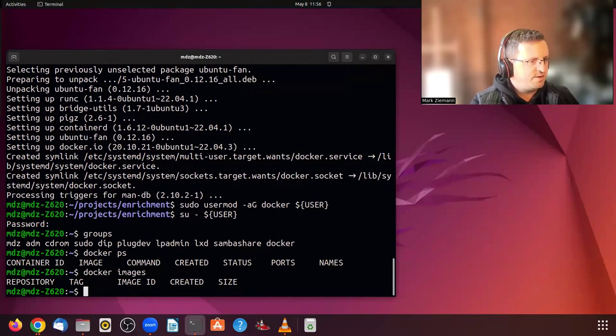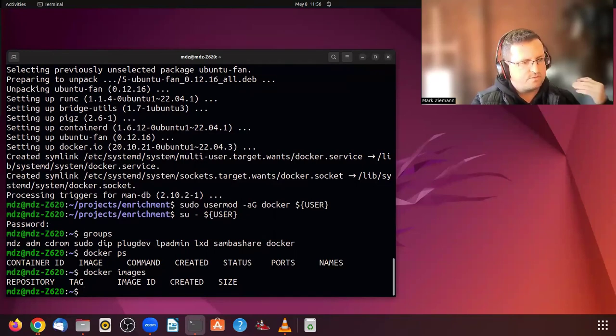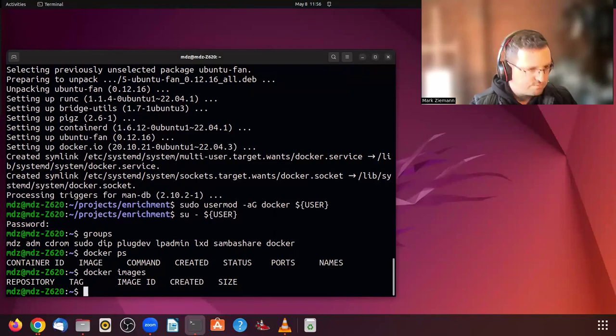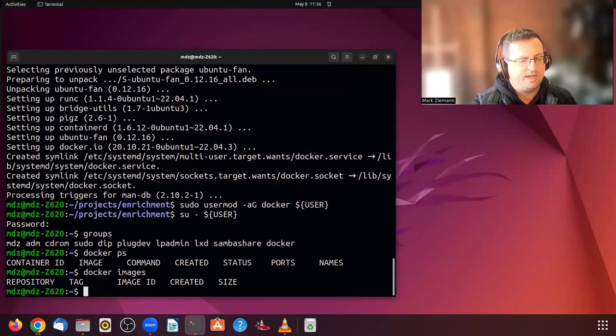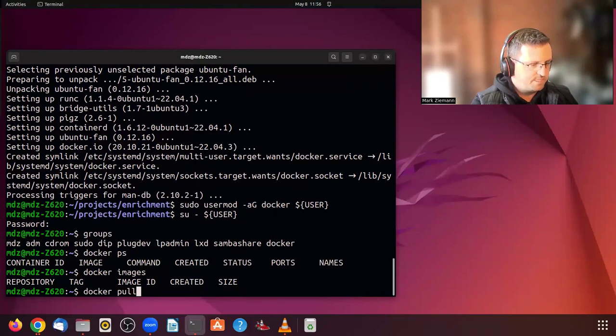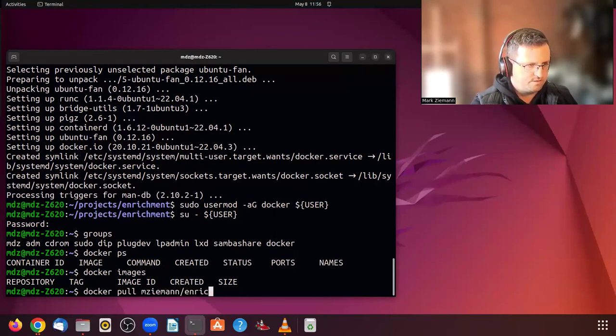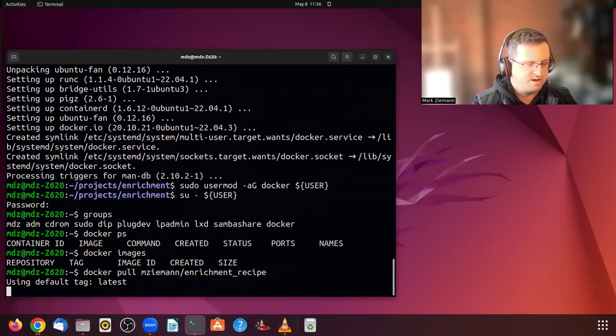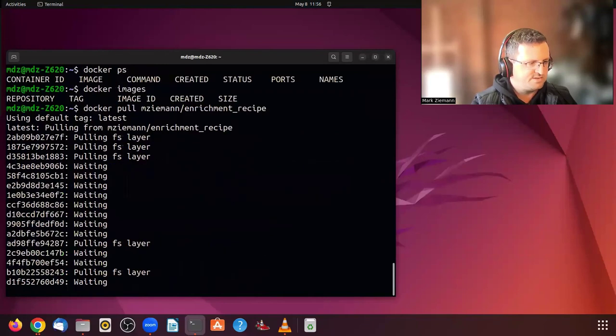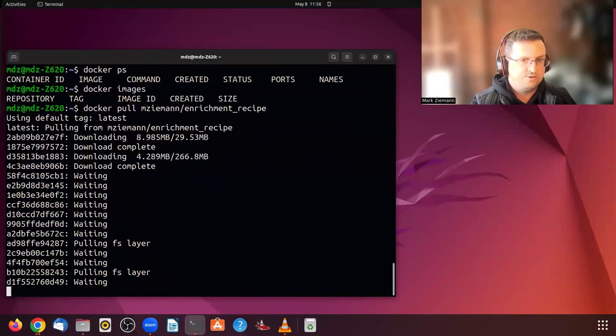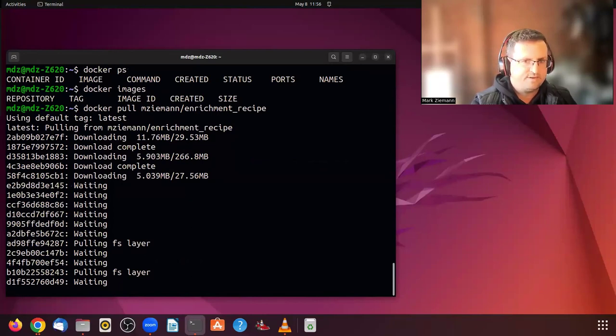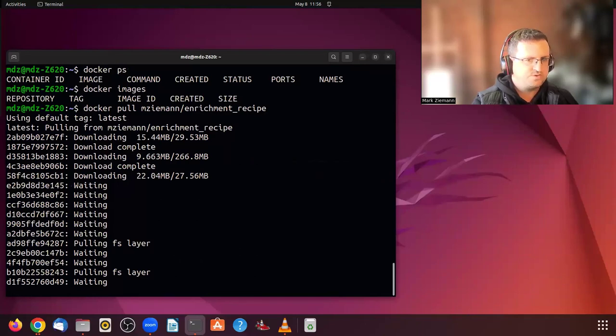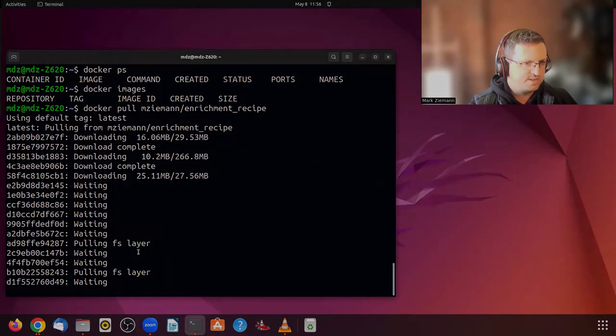What we'll do now is to pull the example enrichment workflow and run that. So let's give it a try. So docker pull mziemann enrichment recipe. So this is an image that I prepared previously. It is working. It might take a couple of minutes to download all of that because it is a relatively heavy image with some data attached to it. So I might fast forward that now.